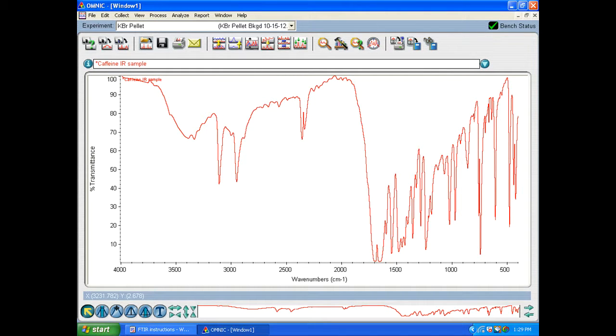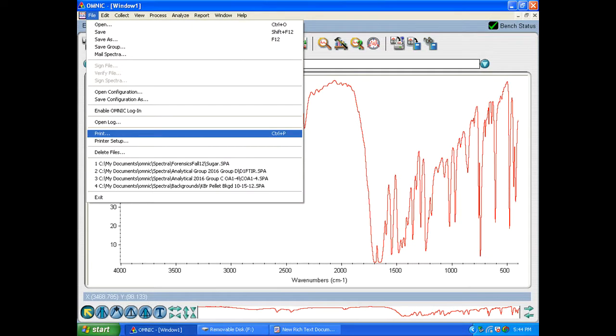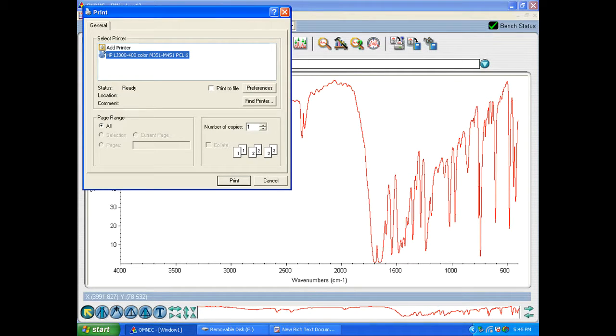So if you want to print out your sample spectra all you have to do is go on up to the top to file and then to print. And print it out to the HP printer that is shown there connected to it. And that's all there is to it.